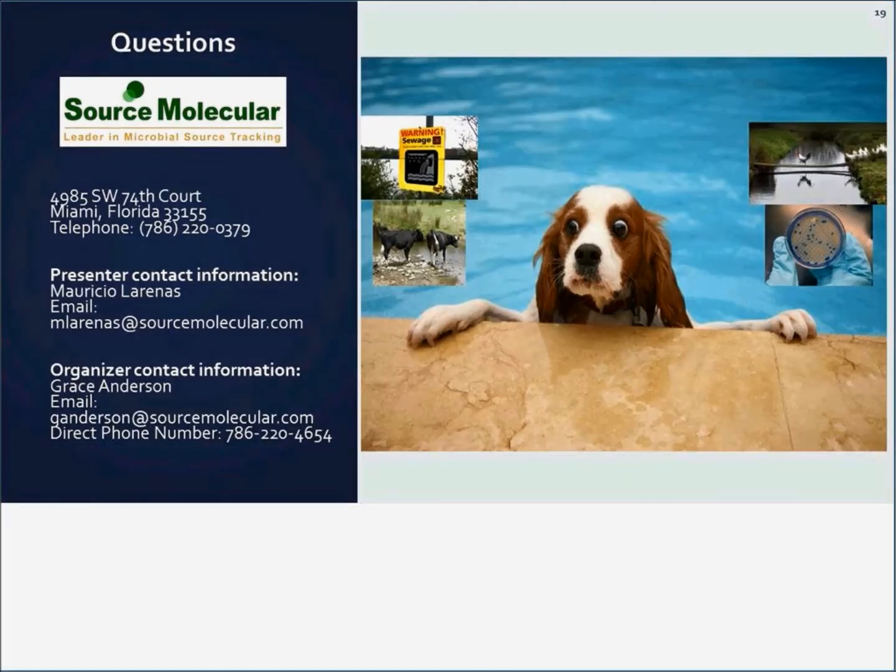We have one that's about testing felines. People are seeing cats in their creeks. Cats. We don't have a cat test. I saw something the other day. Theoretically, there is a cat test, but I haven't seen a lot of work in that area. I think it's an area of interest. There probably will be, but my understanding is there is no cat test right now.